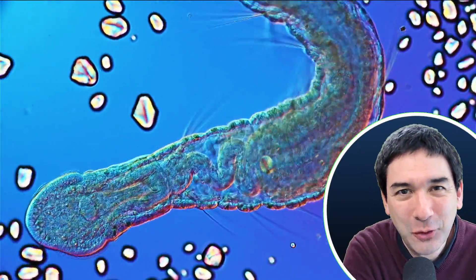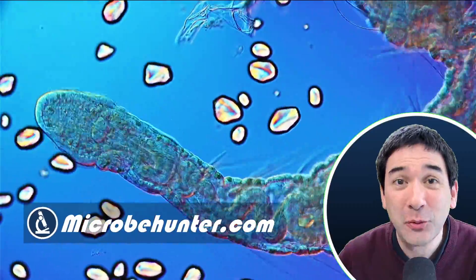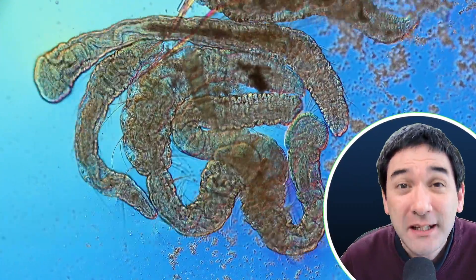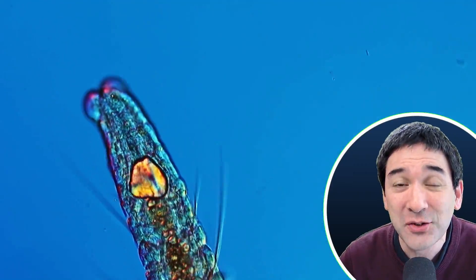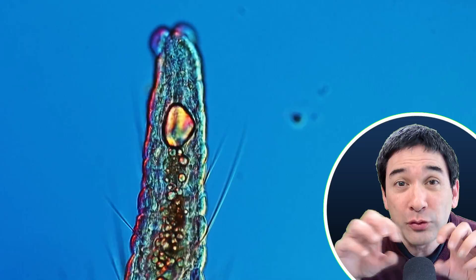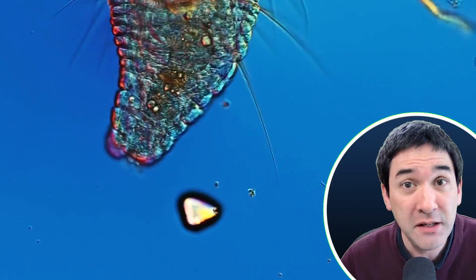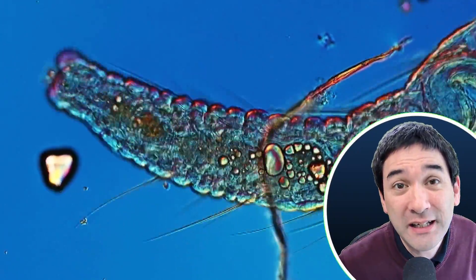Hello and welcome again. Microbe Hunter here. I'm going to put some worms under the microscope today, but don't worry — they look pretty cute. I'll be feeding them not only potatoes, but also yeast. I think it's quite nice to see how the food they're eating travels through the digestive system, and this is basically all I want to show you today.